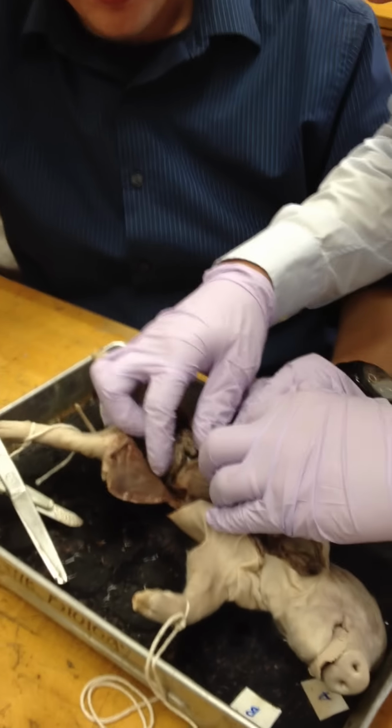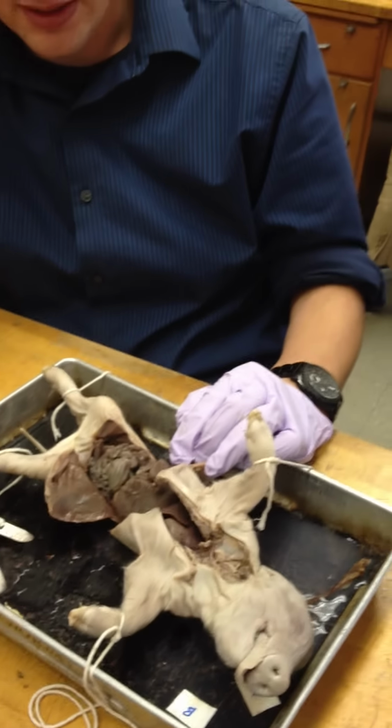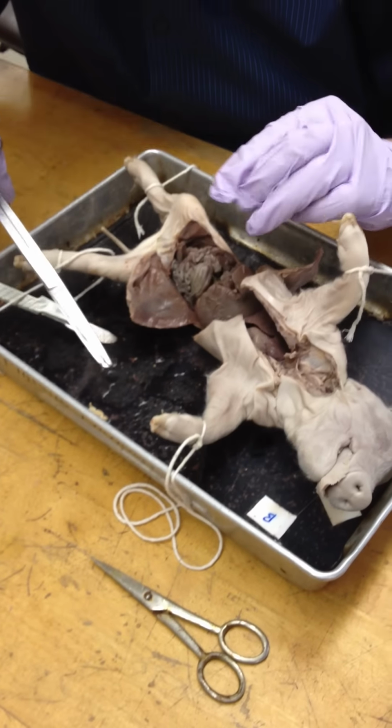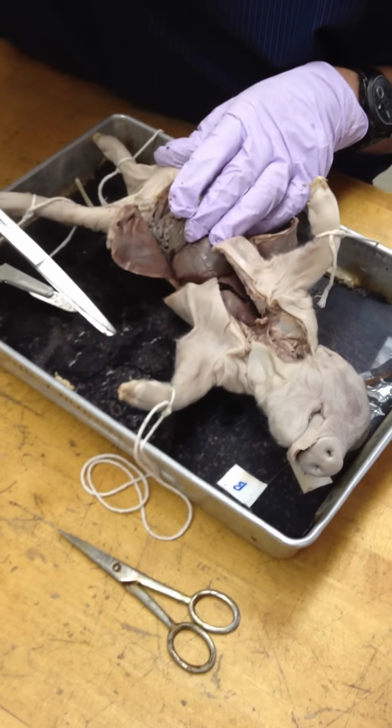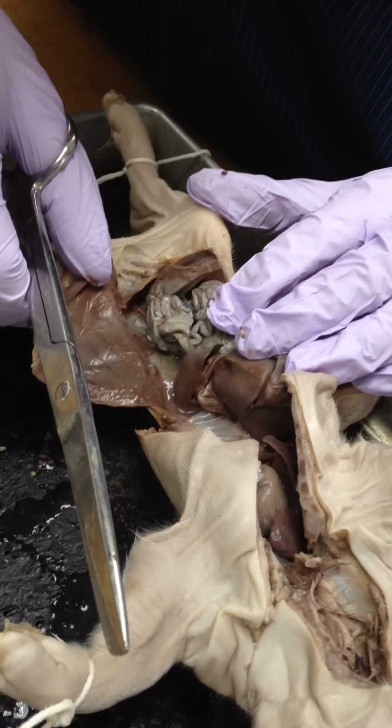I hope everyone else's dissections don't go this badly. I think this is probably goo from either the stomach or large intestine or something unpleasant. I mean, I could be wrong. It might just be preservative, and they're all going to be this horrible. But I don't remember it being this bad. I guess it's kind of hard to see. But then again, I don't think I've cut one up in a long, long time.